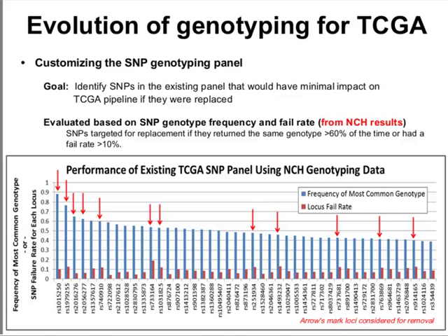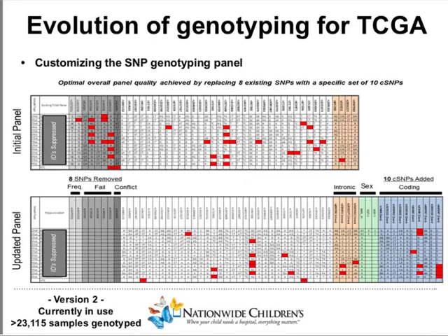Now the next slide, I'm going to show you the final result, and I'm skipping the 3-ish months that we spent optimizing the conversion from our 45 to where we ended with, which was 50. It was essentially add in all of them so that we were running 63, and then start to remove the ones that looked like they were either competing with each other or had already been identified as ones we probably wanted to remove so that we could minimize the change.